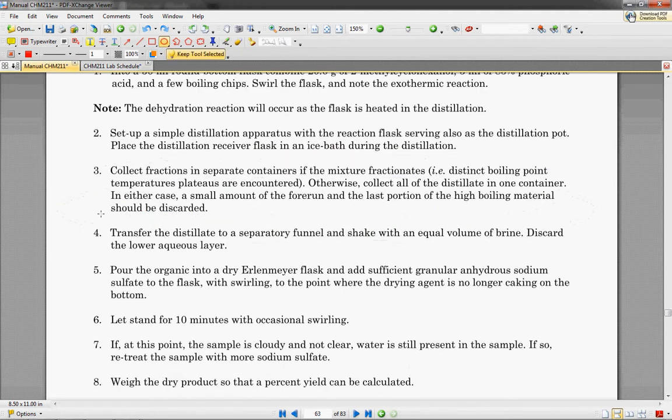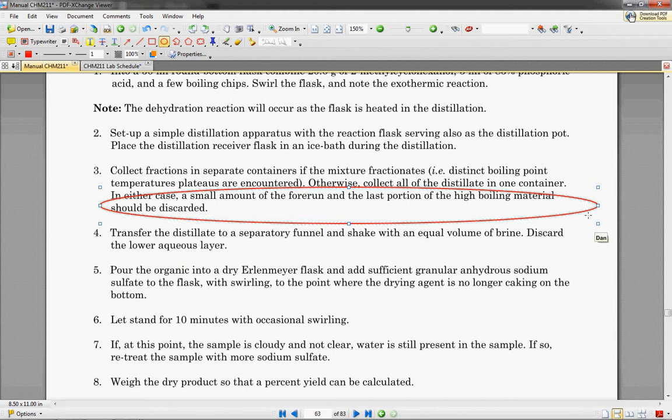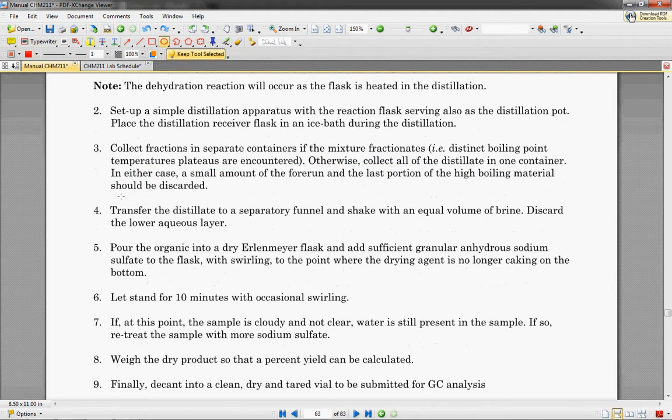Once you've gotten all your fractions, a small amount of the forerun and the last portion of the high-boiling material should be discarded. That's just to get rid of small impurities that you may have.